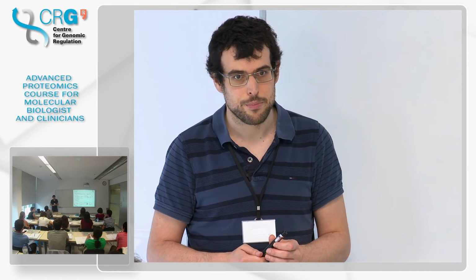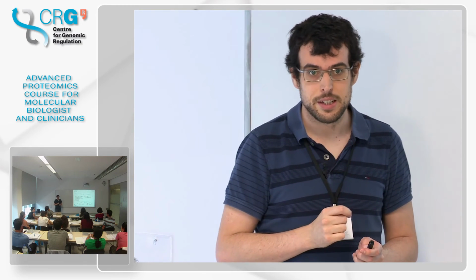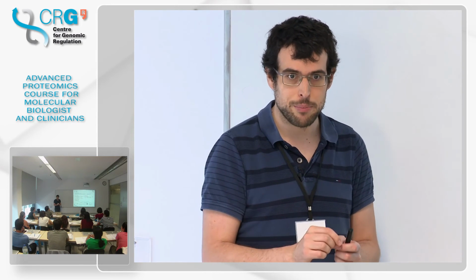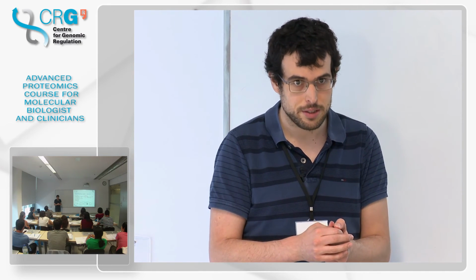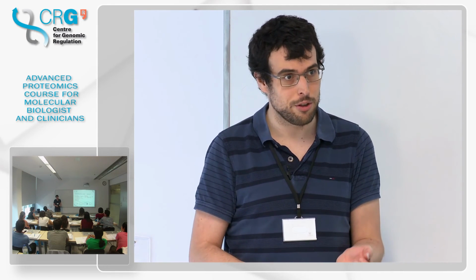Okay? But you need to know very well what you're looking for in advance. Exactly, yes. So you know that this transcription factor is key for your process, and then you select unique peptides for this, and you have to study a bit the peptide and which fragments it will generate. Yes. So this we will see and do on Wednesday.